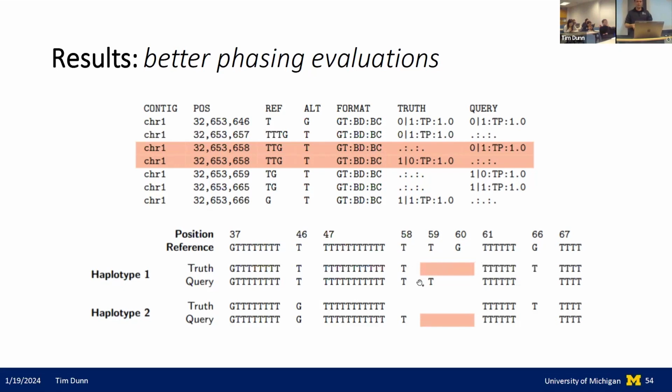So here we can see the real difference is, here the truth says a T and G are missing. And that basically, it just places the T later on instead of at this same position. So it's only the variant representation that's kind of causing all these false positives.